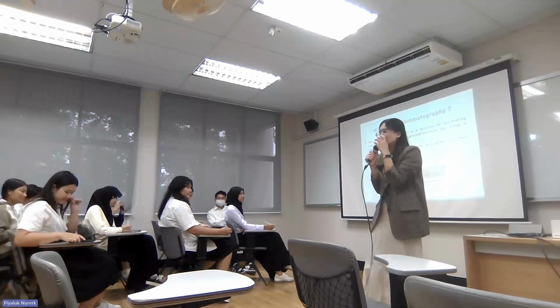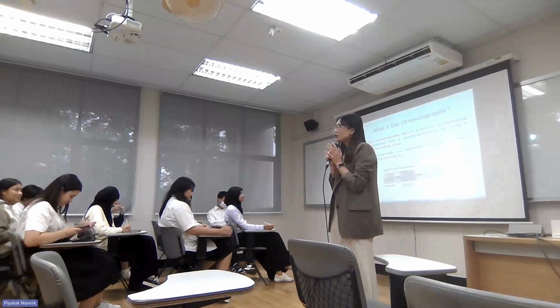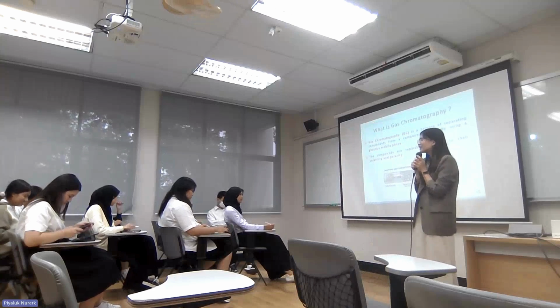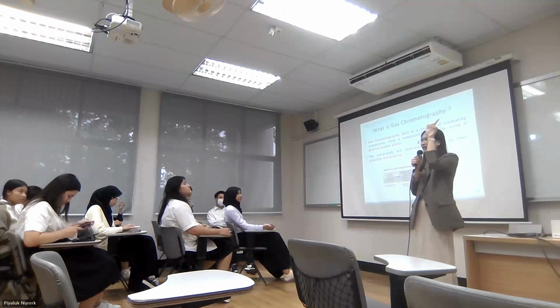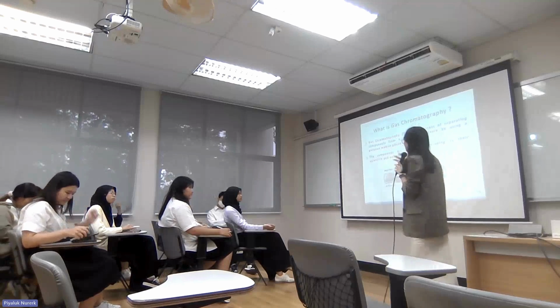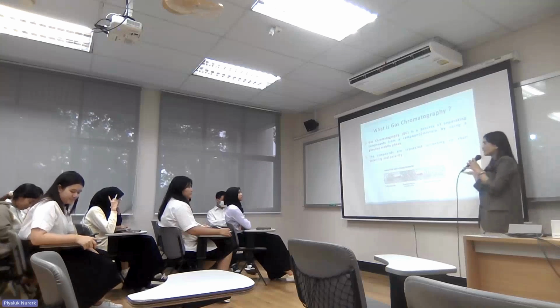Can you remember some words of chromatography that you studied last week? Separation. How about another word? HPLC. Another? GC. GC, HPLC, GC, that's all. Thank you very much. And for today, you will learn about GC.